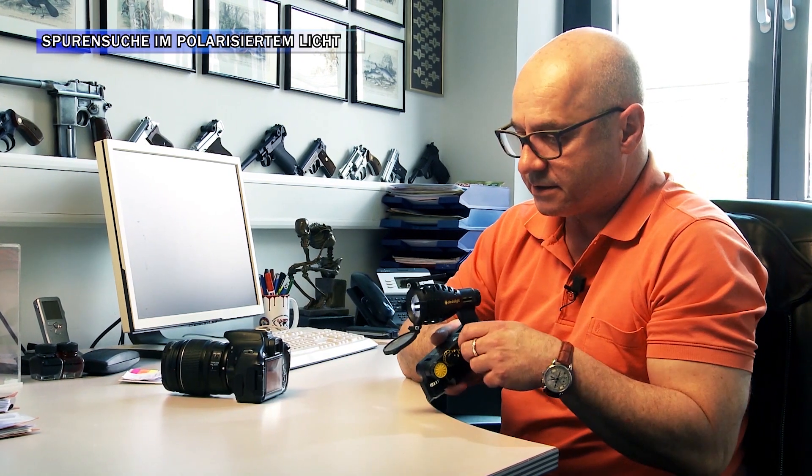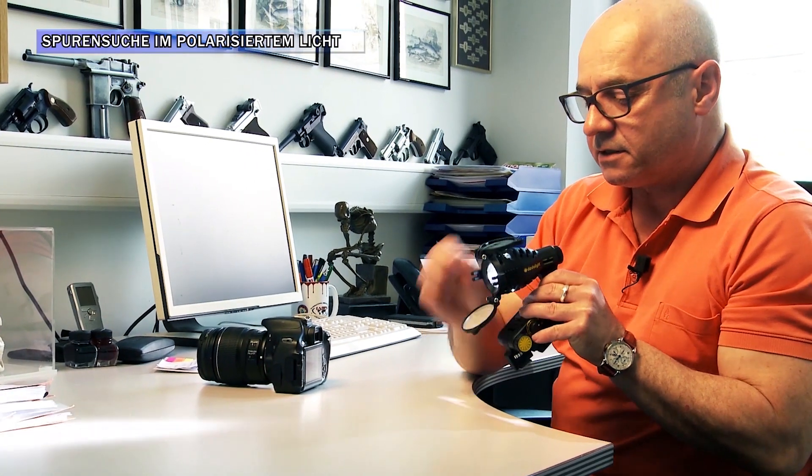Was ich hier habe, ist die Weißlichtleuchte aus dem Multispektral-Kit von DedoLight. Die hat neben der Möglichkeit des stufenlosen Dimmens der Helligkeit die Möglichkeit, die Farbtemperatur einzustellen. Des Weiteren bietet sie zwei Vorklappfilter: Das eine erzeugt ein Licht im 16-zu-9-Format, der andere erzeugt polarisiertes Licht.